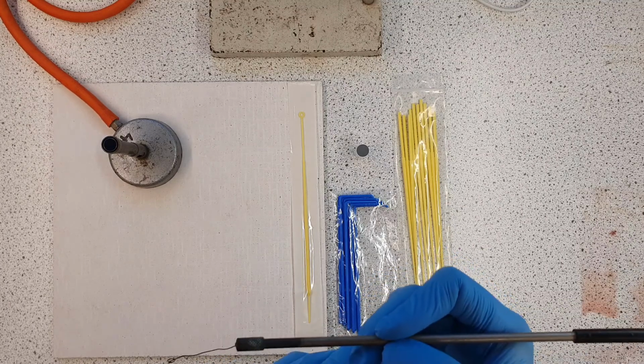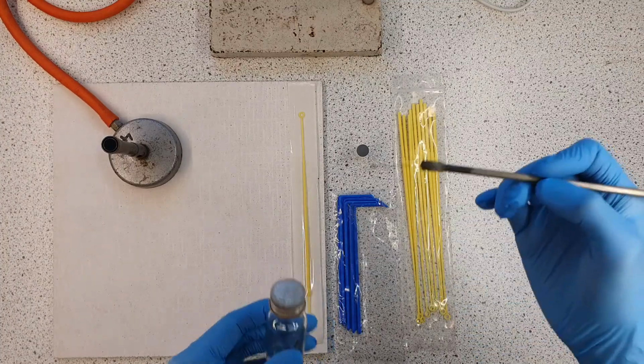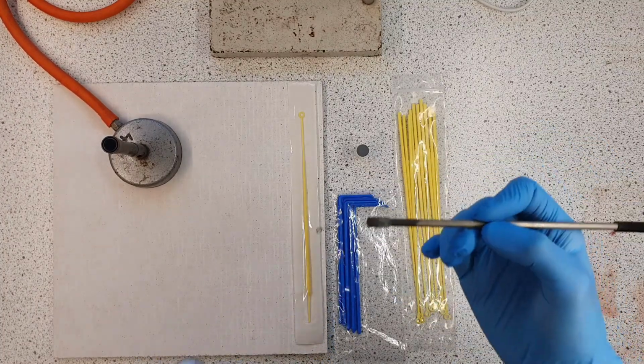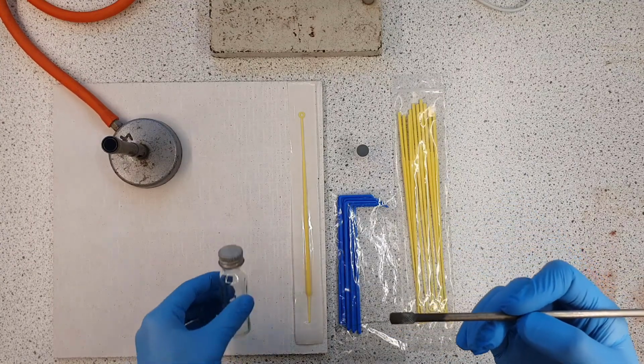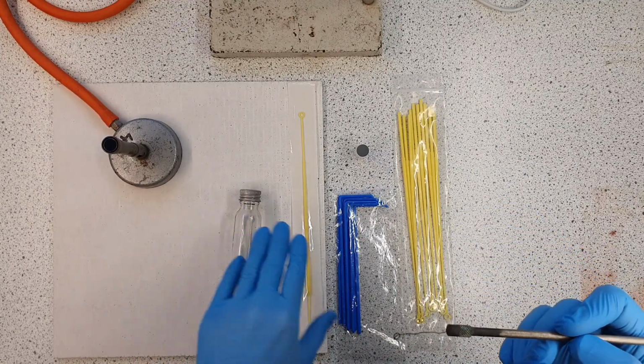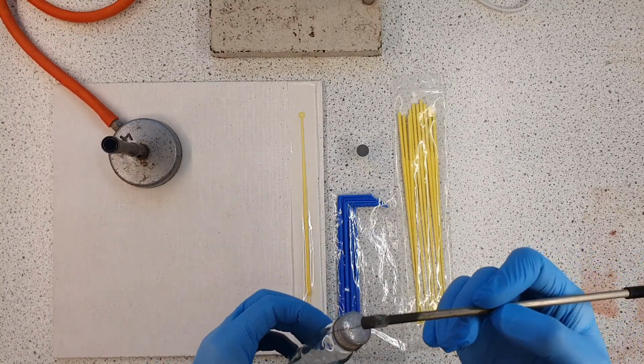So part of that is making sure that we don't put anything down while we're using it in a sterile condition. While it's in the air and in this convection current, we can more or less call it sterile. But as soon as you start putting things down on surfaces, anything that it might touch is potentially a hazard.